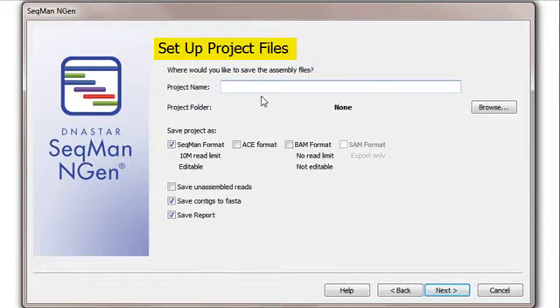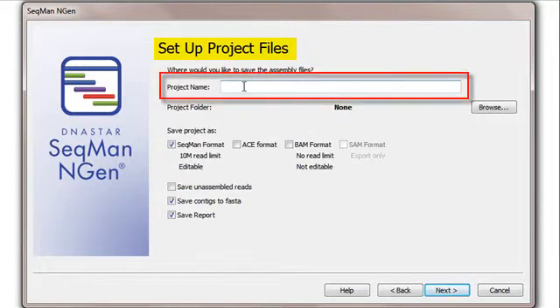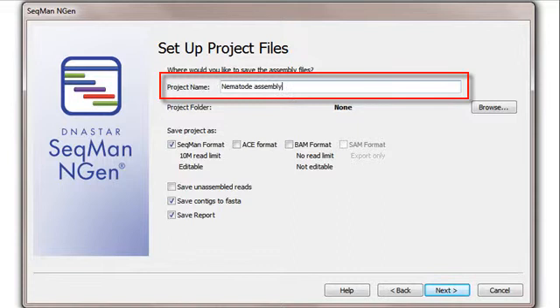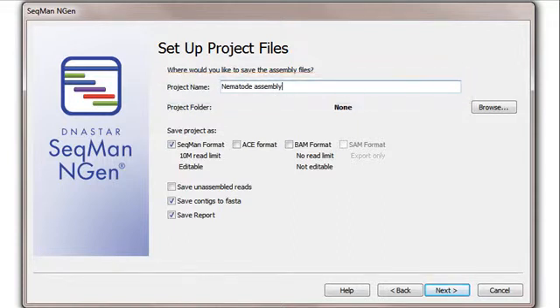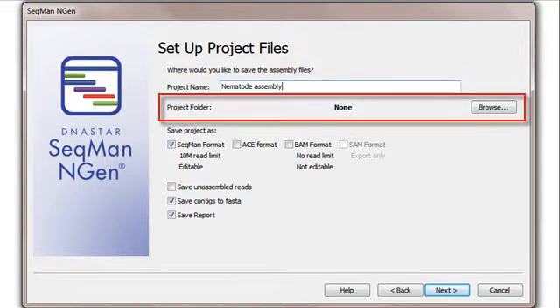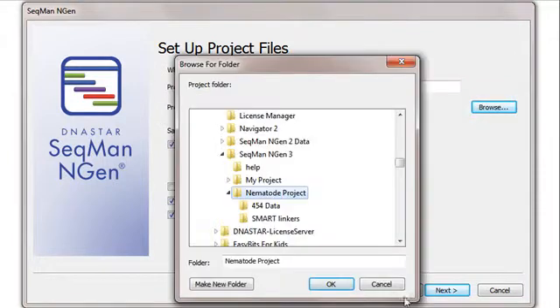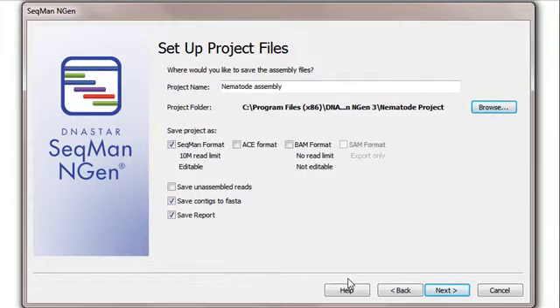In the Setup Project File screen, I'll type in my project name. I also need to select a folder in which to save assembly-related output. Then I'll proceed to the next screen.